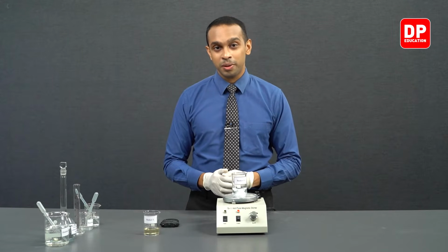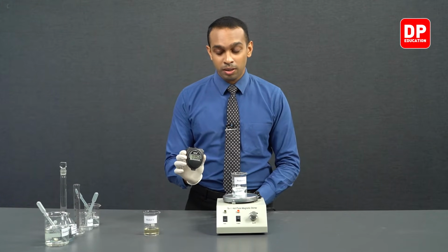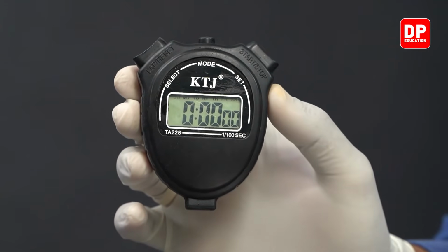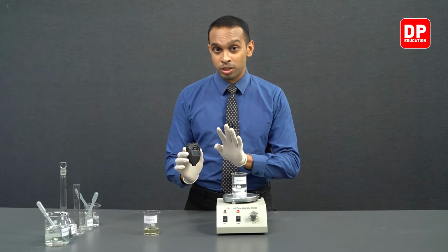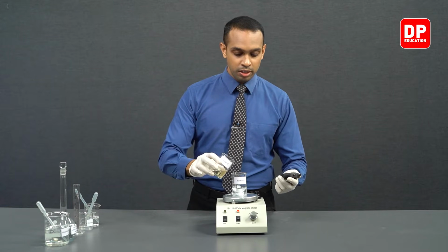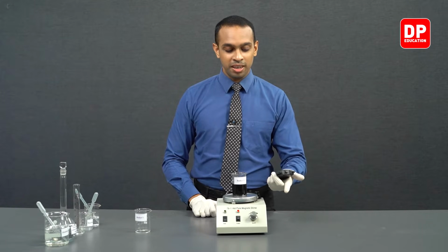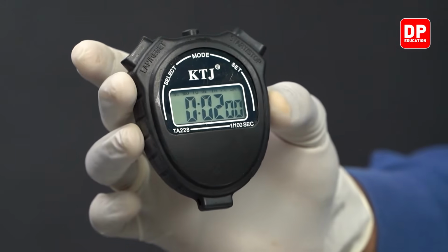At this point, we can proceed to add the contents in beaker 1. As soon as you add the contents in beaker 1, keep in mind you need to start the stopwatch. The stopwatch is now reading 0, and as soon as you add the contents in beaker 1 to beaker 2, you need to start the stopwatch. And then as soon as you see the color change, you need to stop the stopwatch. Now we are going to add contents in beaker 1 to beaker 2 and we are going to start the stopwatch. It took exactly 2 seconds. It took exactly 2 seconds for the color change to appear.